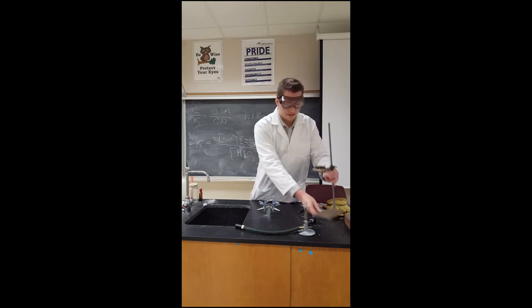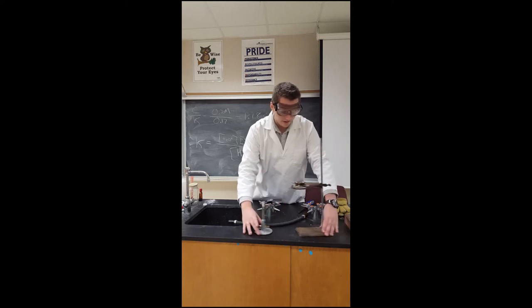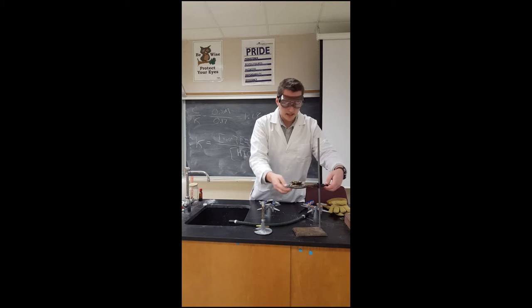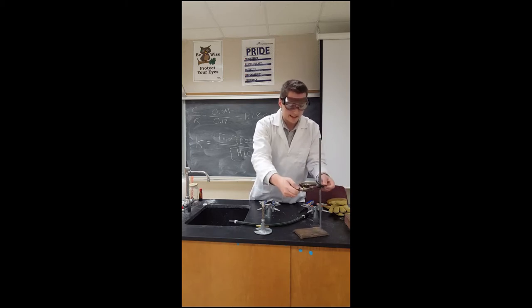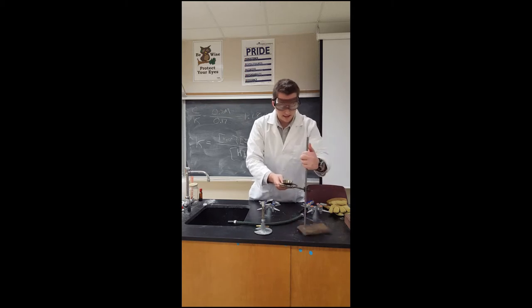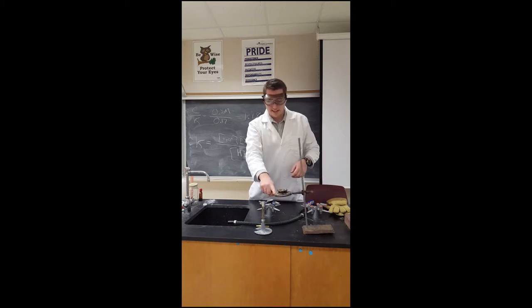So first things first, usually we have something called a ring stand — we have a metal base here and you screw this thing in, and then you attach this thing here. You can adjust it up or down, and a lot of times we have it in this position because it's more stable, rather than having it like this. Sometimes we kind of need to do this but it's not really recommended because then it'll tip over on you, and that's not good.